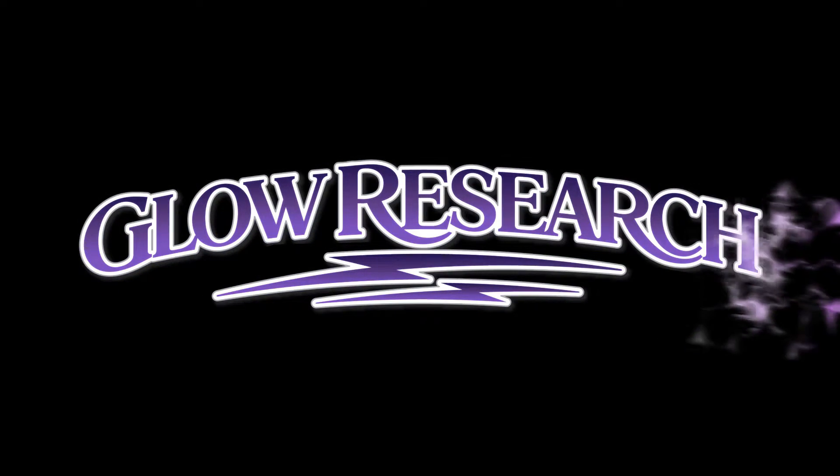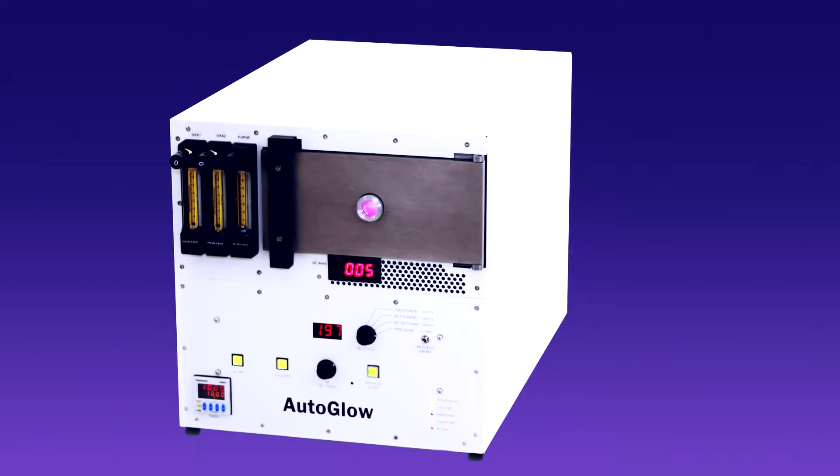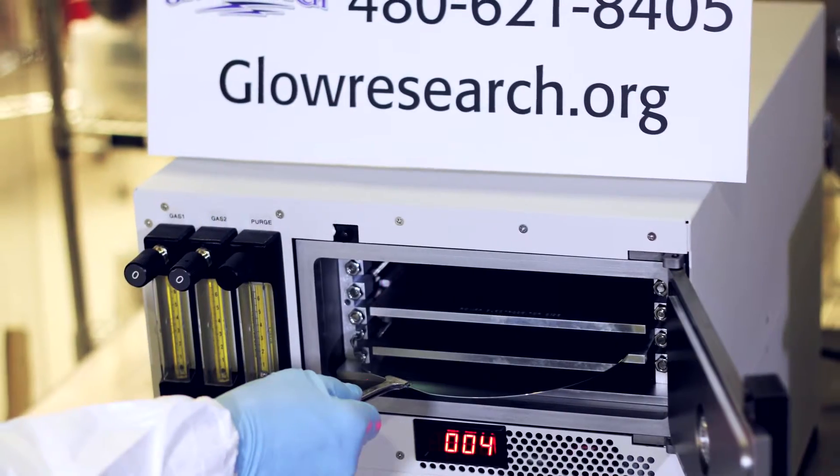Ready, Set, Glow! The Glow Research Autoglow is a tabletop plasma system designed for 200mm or 8 inch by 8 inch substrates.